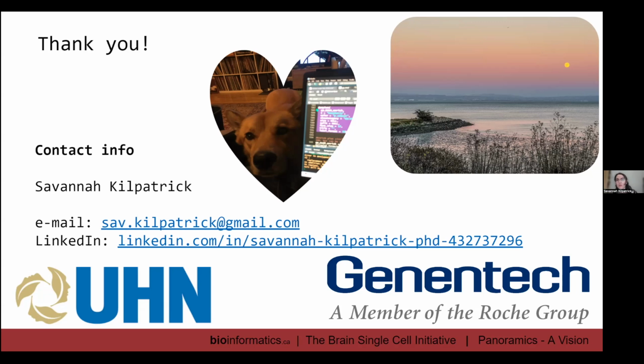Yeah, great question. So as was mentioned, bulk RNA sequencing is really powerful. You're looking at your aggregate signature. So if something is strong enough to come out in bulk RNA sequencing, it's likely that there's something there. That being said, because of the degree of heterogeneity within Visium, where you're getting such a small section of tissue, it's unlikely that all of those DEGs will be present in your section, right?